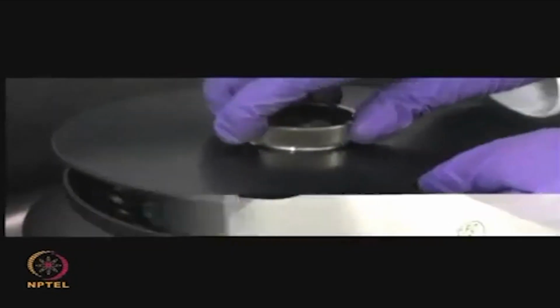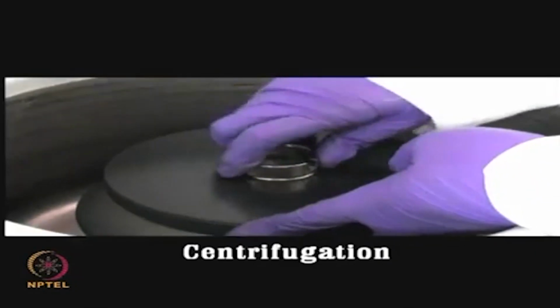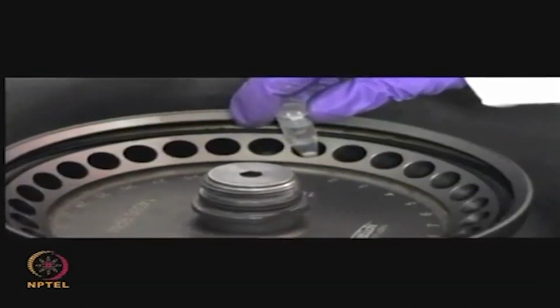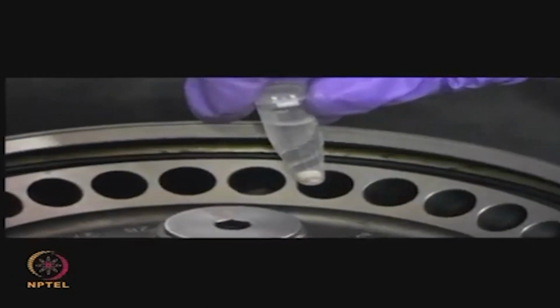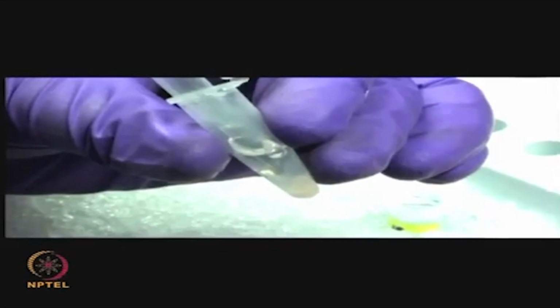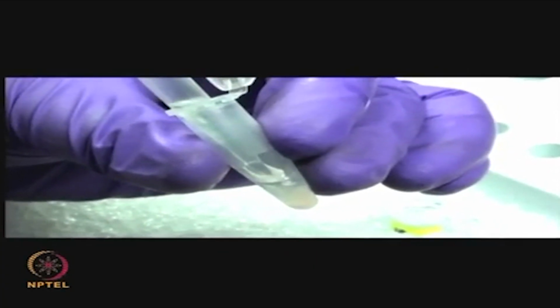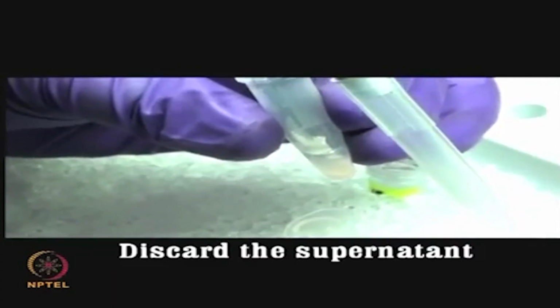Place this tube at -20 degrees Celsius for at least 4 hours before centrifugation to enable complete precipitation of proteins. Then remove the tube and centrifuge the contents to allow the proteins to settle down as a pellet. Carefully discard the supernatant and dry the pellet at room temperature.